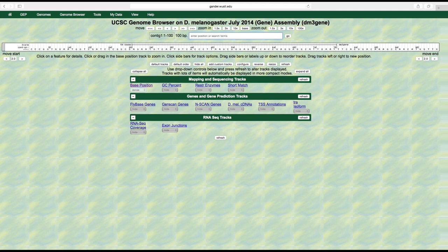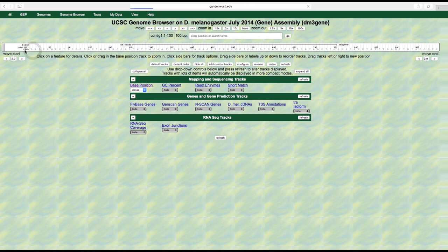After we hit return, we are now able to see the individual bases of one strand of the DNA sequence — A's, T's, C's, and G's. If you click on the arrow below the scale contig 1 label, you can see the strand that is complementary to the top strand — in other words, the bottom strand. Click the arrow one more time to view the top strand again.